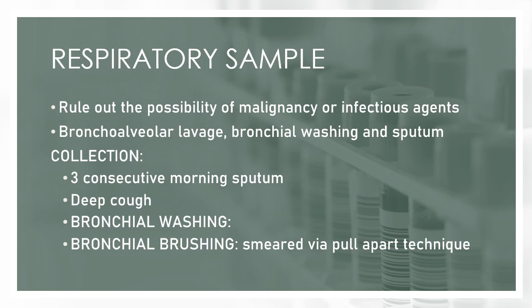Again, for the sample of your sputum, it should be three consecutive morning sputum with a deep cough, collected in a wide mouth vial containing Saccomanno fluid, which is made up of 50% ethanol and 2% carbowax.